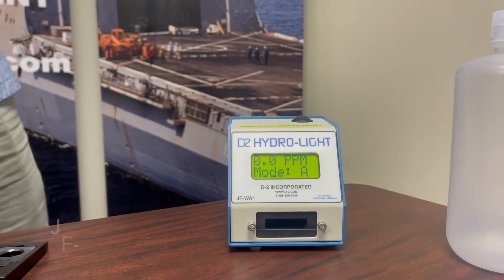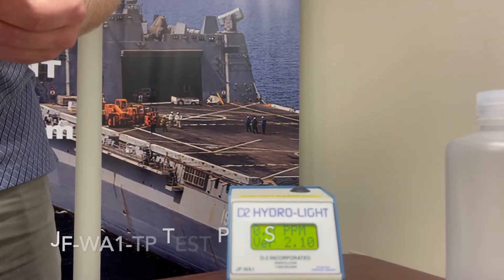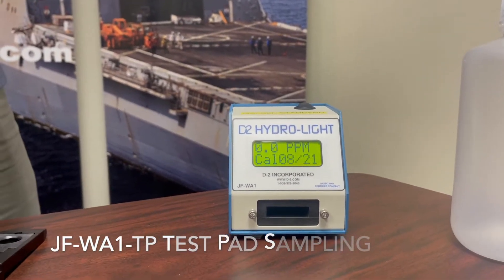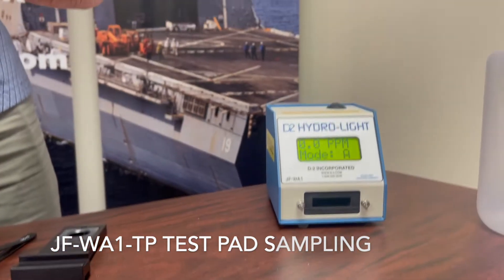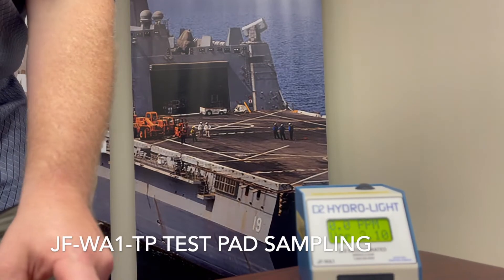You'll need a digital free water detector pad. This pad is going to allow you to pass a fuel sample through in order to determine how much free water is in that fuel. Open up the pad and very carefully remove it with tweezers, ensuring you don't ever touch the surface of the pad.